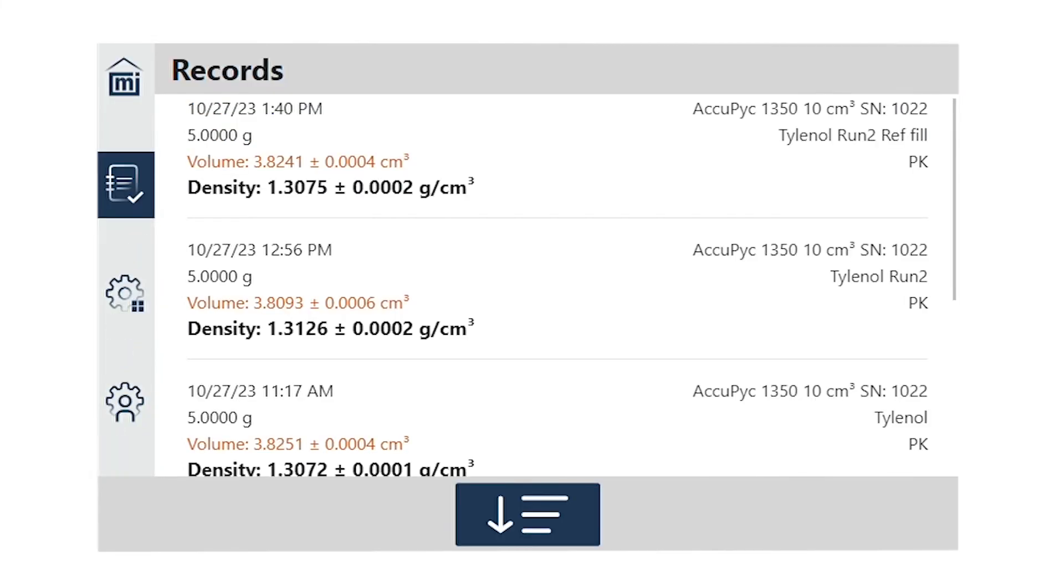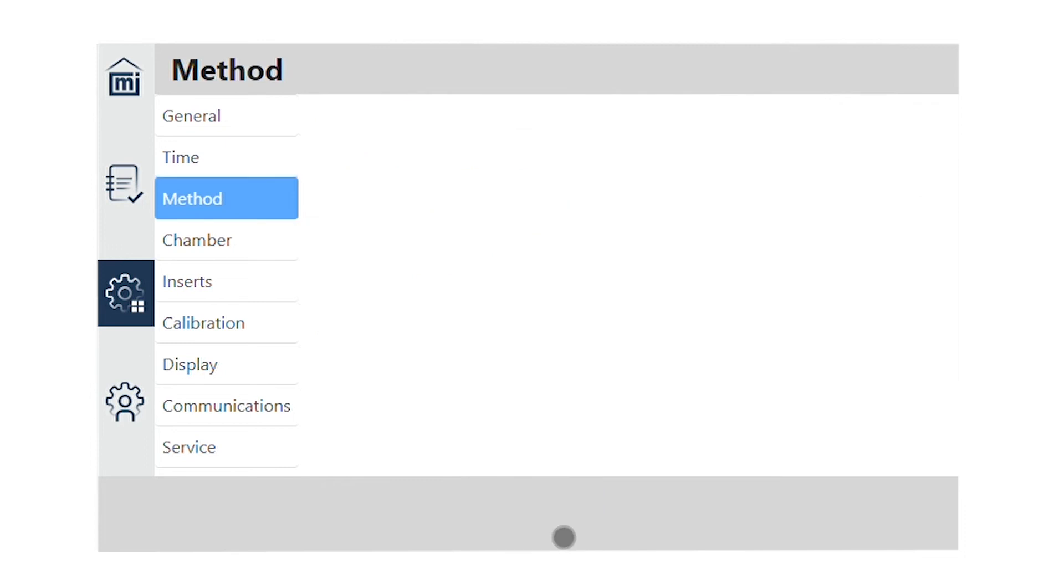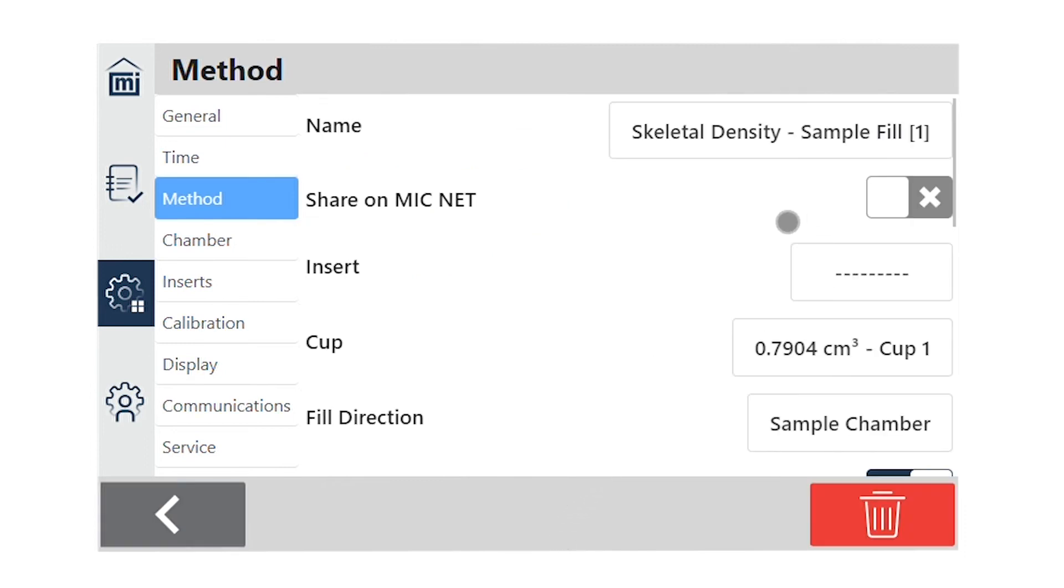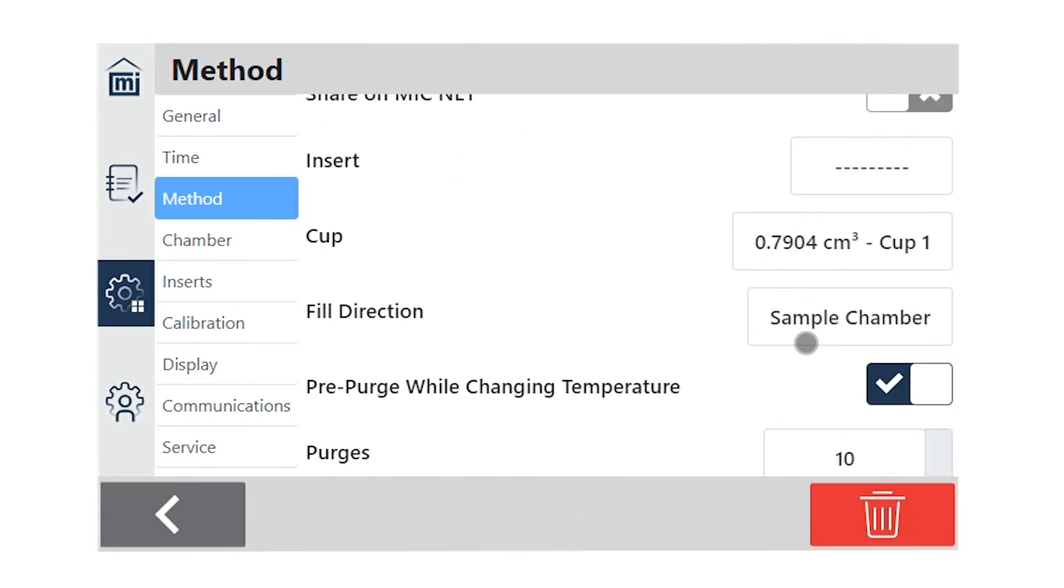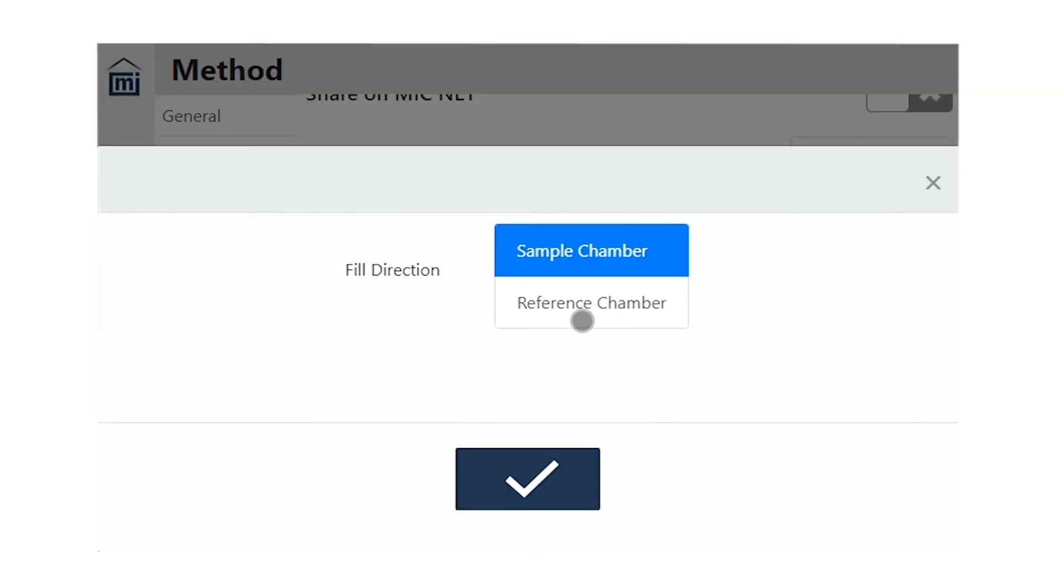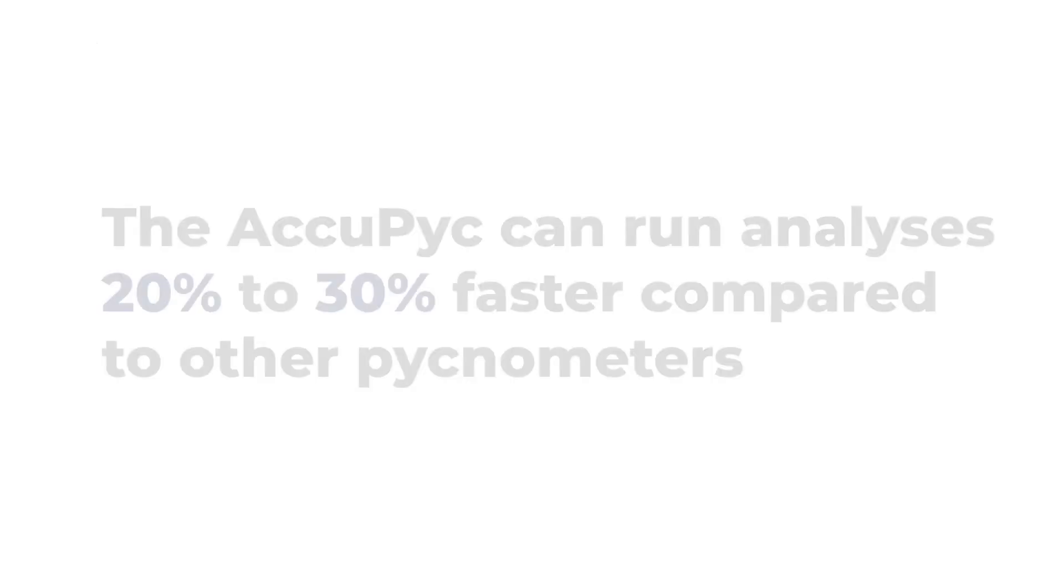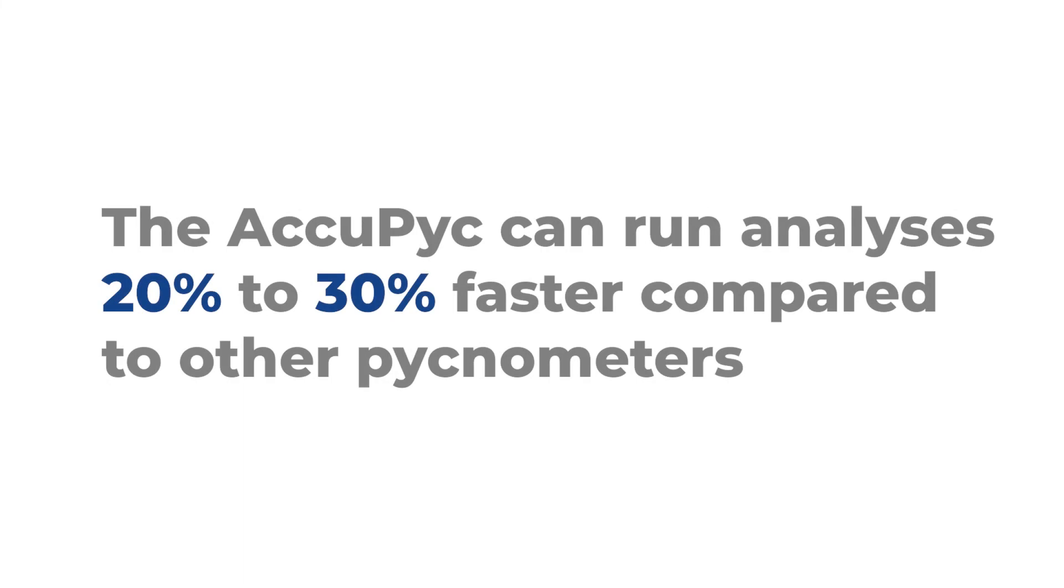The AccuPIC lets you create stored methods so you can save your test settings. Here we can define all the analysis conditions, including the fill direction. This increased temperature stability allows the AccuPIC to achieve up to 20-30% faster analysis times than other pycnometers.